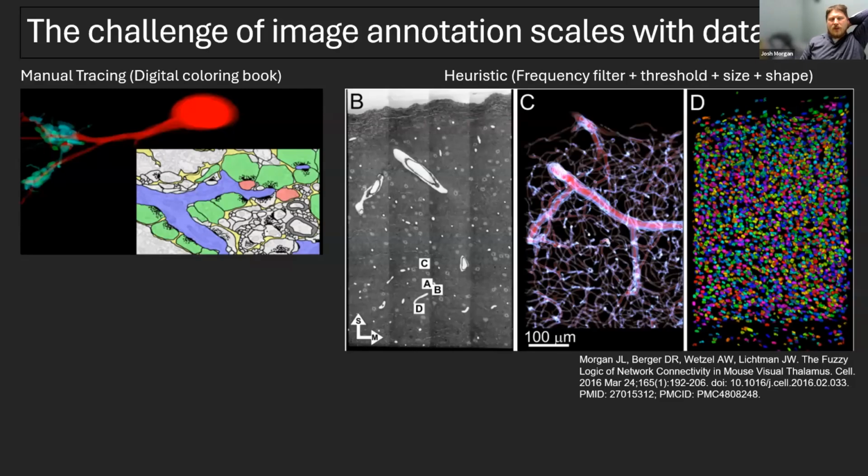I think the bandpass filters are available in ImageJ if you go to Process and FFT. So playing around with bandpass filters is really easy there, and you can see what kind of features things enhance or don't enhance. You can probably do size filtering and shape filtering through that afterwards, although everything that we've done is just custom code. I hope that helps.